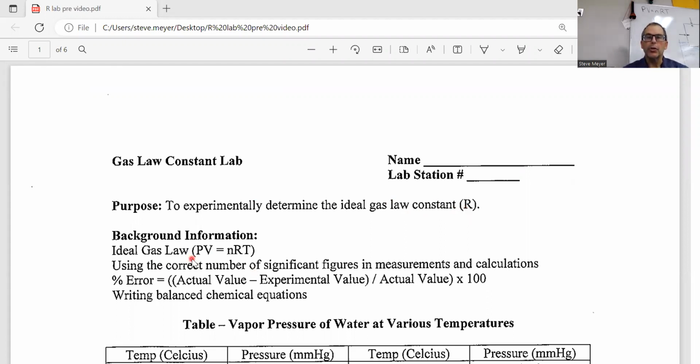So in other words, we're going to have to do an experiment, and we're going to react some magnesium and hydrochloric acid to form some hydrogen gas. And we're going to know the pressure this is at. It's a direct measurement using a barometer. We're going to actually collect hydrogen gas in a big long tube called a eudiometer, or a gas collecting tube, and we're going to measure that volume. We're going to figure out the number of moles by reacting some magnesium, all of it, in hydrochloric acid, and then projecting how much hydrogen gas that should produce using the mole train.